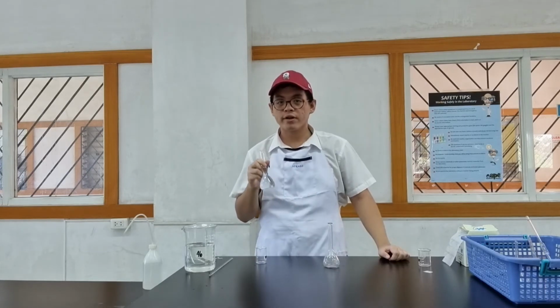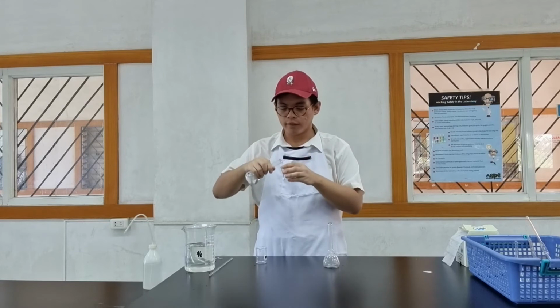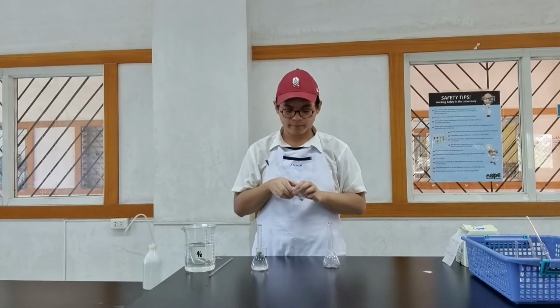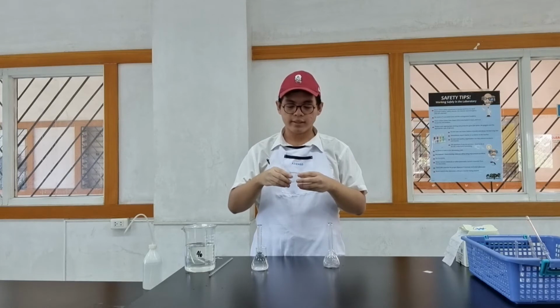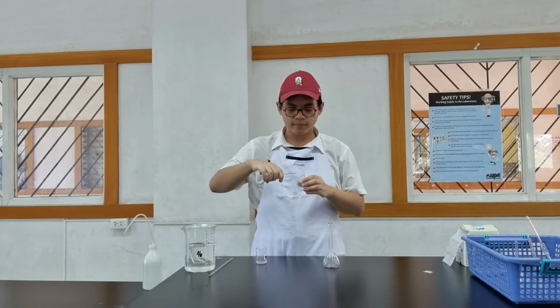I'm going to transfer the contents first to another container before I start measuring my 10 ml. Since I'm dealing with volumes once again, I add a little and then I rinse it 3 times. Make sure that you wet all the sides. That allows all the dirt and other chemicals to be washed away by the liquid that you're rinsing it with. And then I throw it out. That's first pass. I need to do this 2 more times.